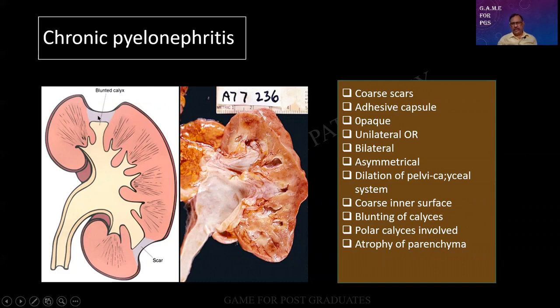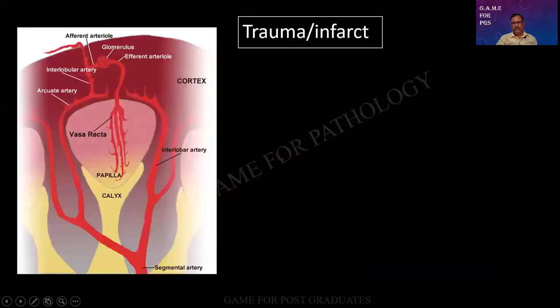at the corresponding regions. Be very strong and assertive when you people give a diagnosis. In this specimen, obviously it is not very healthy. There has been some damage that has been done. I find that there is a rounding of the calyces and there is a distension of the pelvis. Accordingly, there can be atrophy of the parenchyma adjoining the calyx.